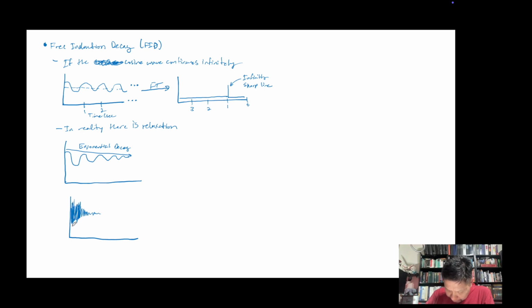Let me make this look a little bit better. This is starting to look like those free induction decays that are actually on the instrument that look terrible. All right, that's a free induction decay, and the decay occurs exponentially. You can imagine that once you get down to this point over here, where there are no peaks anymore, that's where the proton has essentially precessed all its way, all by itself, back to being in alignment with the z-axis again.